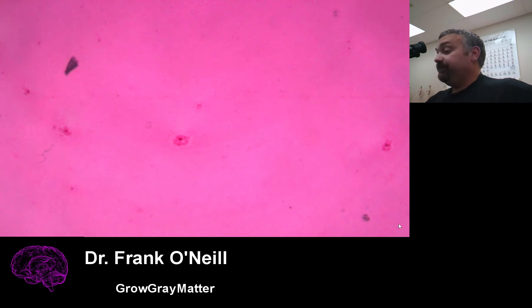So being able to identify them is important, and I'll show you the capsule stain here today. We're looking here at the scanning power, the 4x objective, just kind of tweaking it, making sure it's in focus.